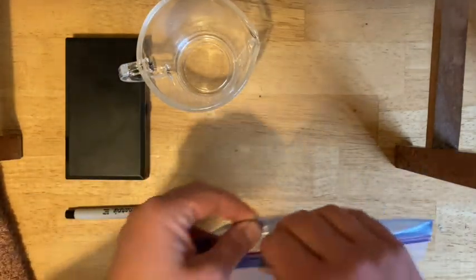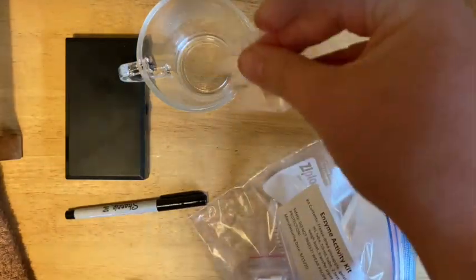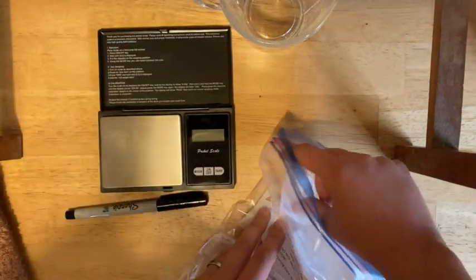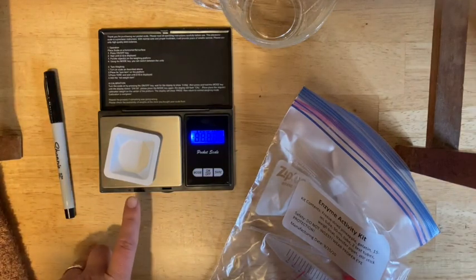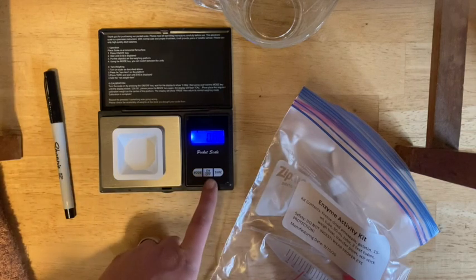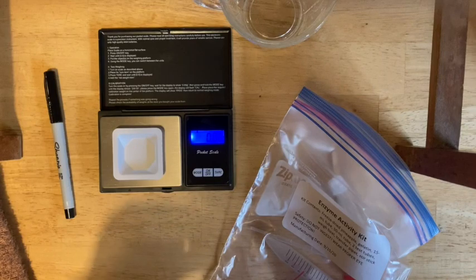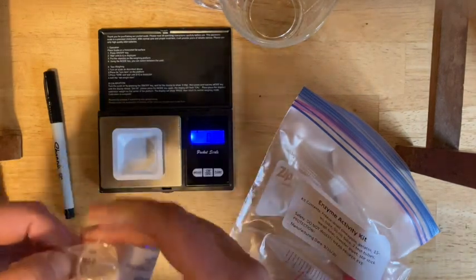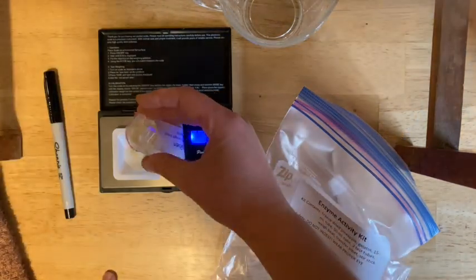The first thing you're going to do is weigh out the right amount of gelatin. You've got your packet of gelatin — use your balance and your weigh boat. Turn on the balance. If you put the weigh boat on there to start, it should automatically go to zero. If you put the weigh boat on after, make sure you use zero or tare the balance so it starts at zero with just the weigh boat on. Then measure out the gelatin to the right amount.